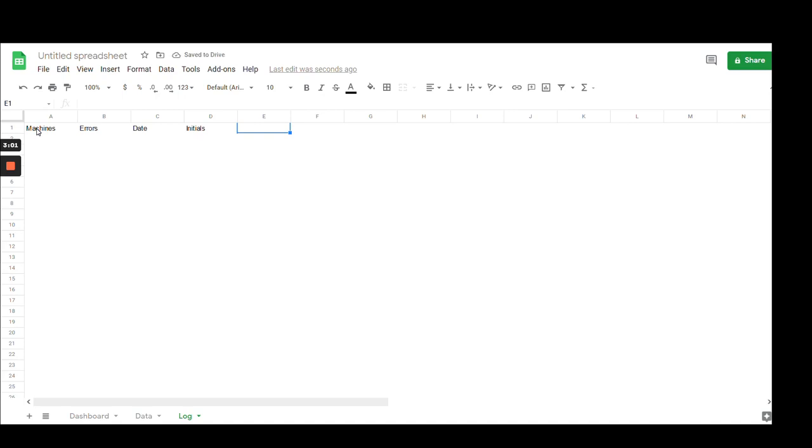And to scan like a sample barcode as well, or have the facility it's collected from, or department it's collected from. We can bold those as well. Of course, you can play around with the fonts and the colors, make it look nice. But we're just going to run through really simple.